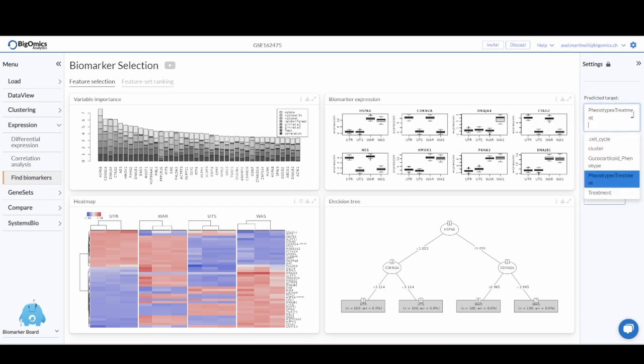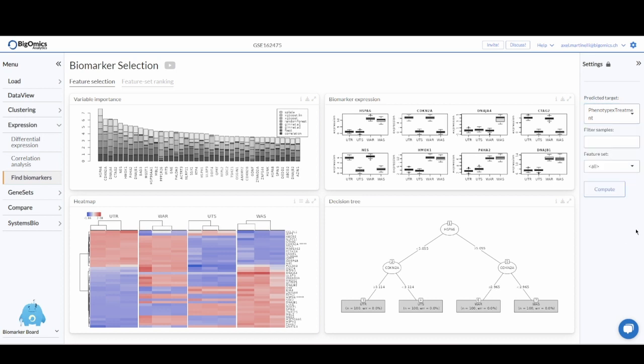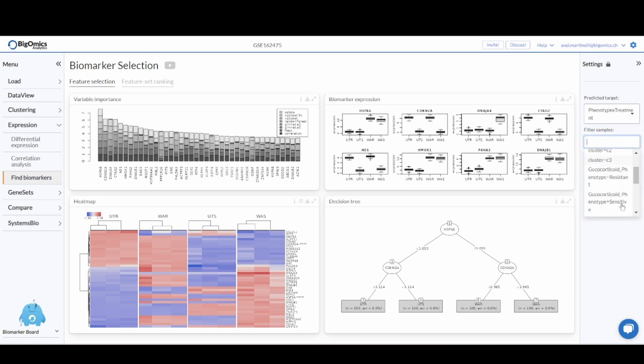You select one of the phenotypes that you are interested in. In this case, I selected the cross between phenotype and treatment. You can then optionally also include only a sub-selection of sample groups rather than all of them for your analysis.